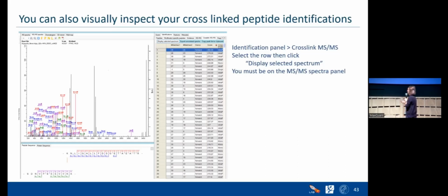And here we have 2 peptides, the longer peptide and the shorter peptide. On the longer peptide, Y ions are shown in red, and here you could find them too, also shown in red. Here we say Y1, and I don't use any other annotation, but just to be sure, I put Y1, it's somewhere here.